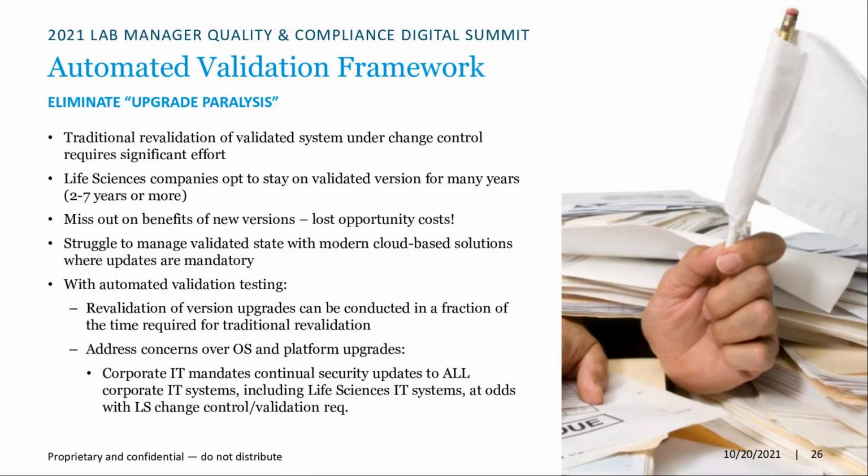I say here 2 to 7 years. I'm not even exaggerating that. We often, at SGS and at my current company, have systems that have been in place, locked into current versions. We still have Windows XP systems, because the effort to revalidate these systems, we have a very small staff, and it's just a lot to take on. So you just get locked into these old systems, missing out on new functionality, lost opportunity costs. I talked about the challenges with cloud-based systems.